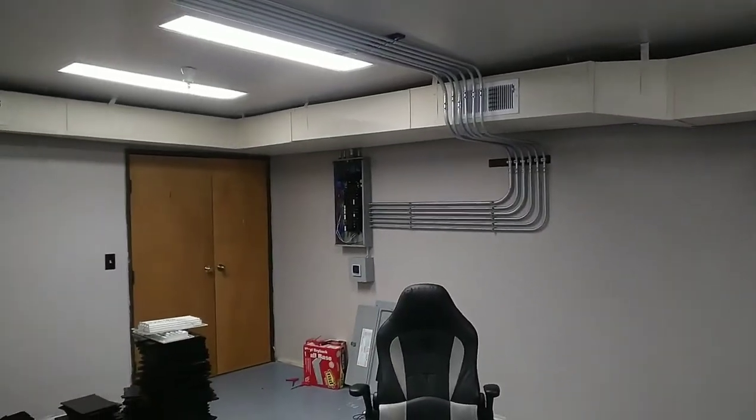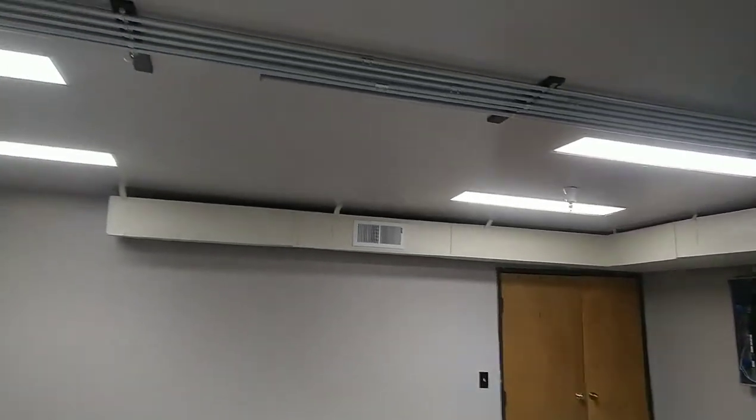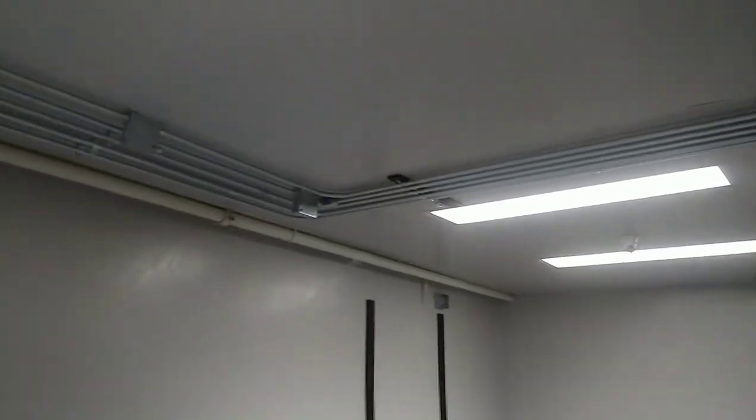New lab. This is just one of the five rooms, totaling about 2,000 square feet, and because of that, I've been able to get a bit bigger of a machine.